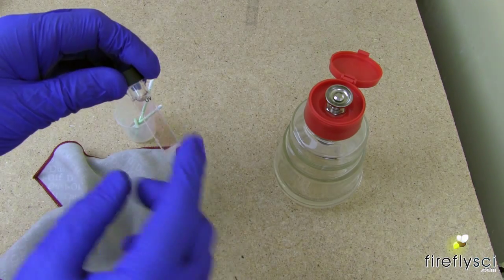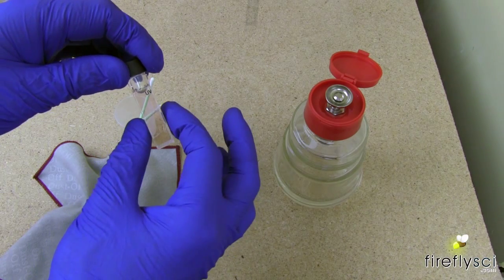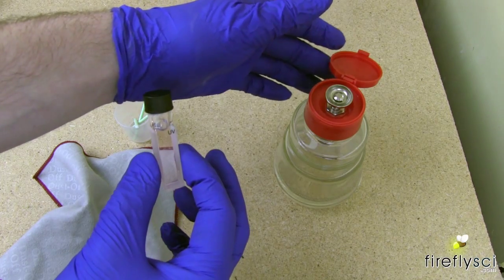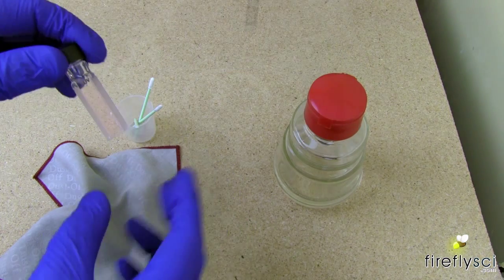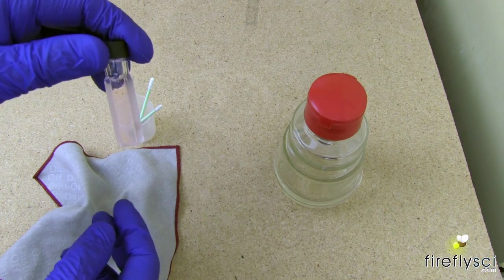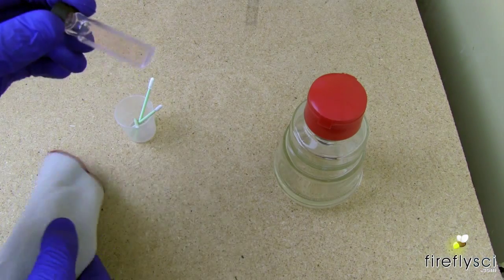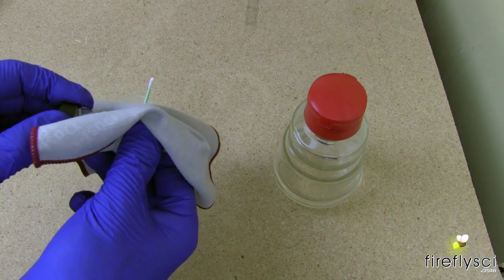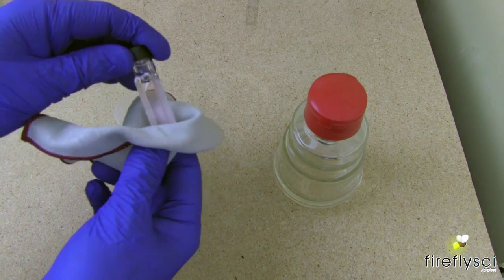Always make sure you hold the liquid filter by the top or by the two frosted sides. And that's pretty much it for cleaning a liquid filter. When you're done with the alcohol, you can just give it a quick rub with your dust-free cloth and that'll be squeaky clean.